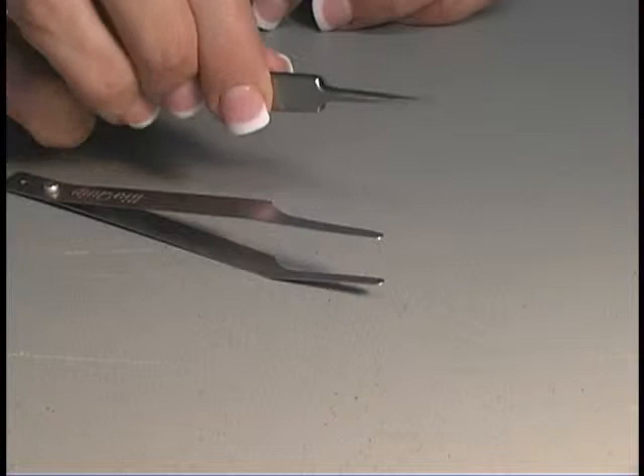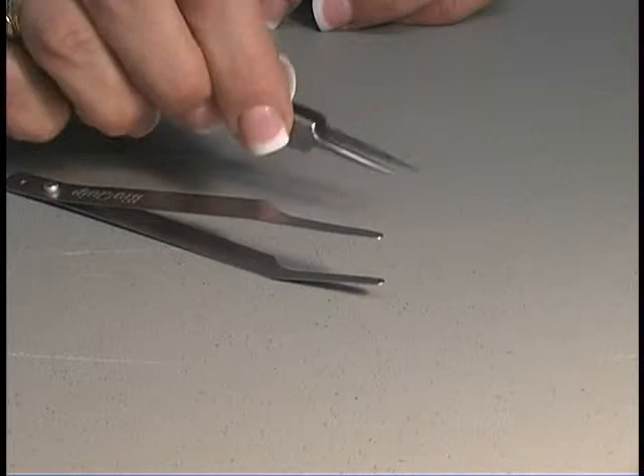There are also hard forceps that are really good at grabbing little insects, but just be careful not to damage those insect specimens.